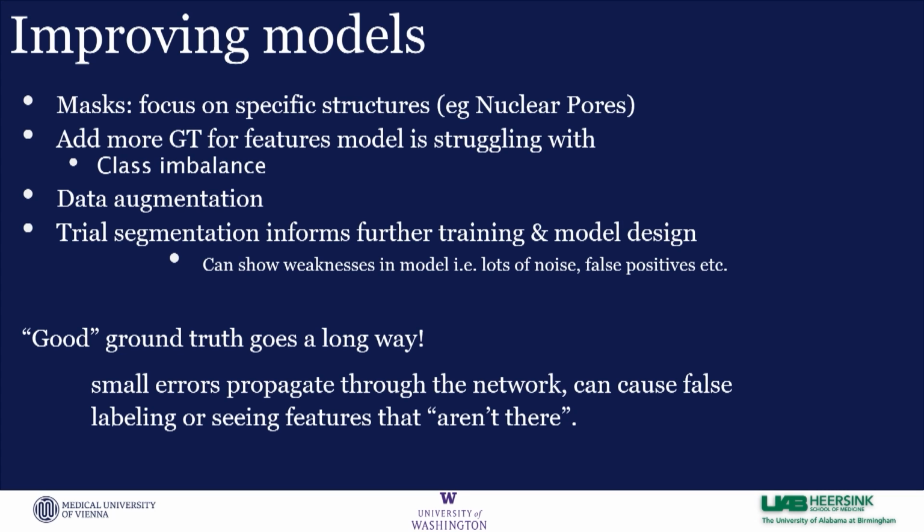And then finally, once you have a model and you feel like in the visual preview of your training it looks good, I'd recommend maybe segmenting a small test chunk, a small volume, just so that you can see what it looks like in 3D, because that's what we were interested in, because that can show you weaknesses that the model has. It might be showing a lot of noise that you just don't perceive in the 2D view.